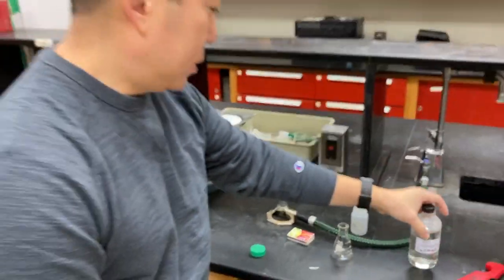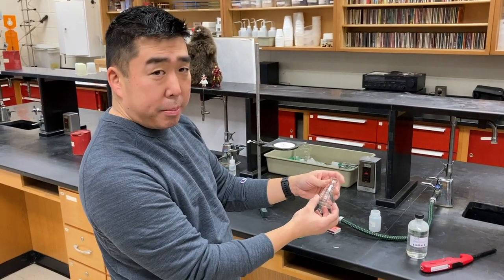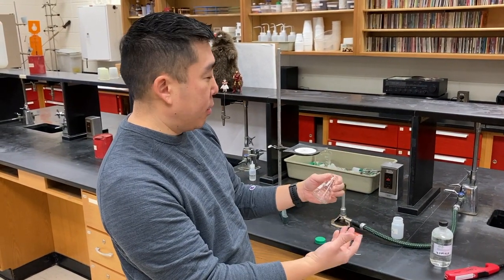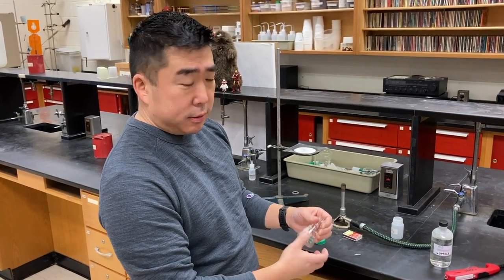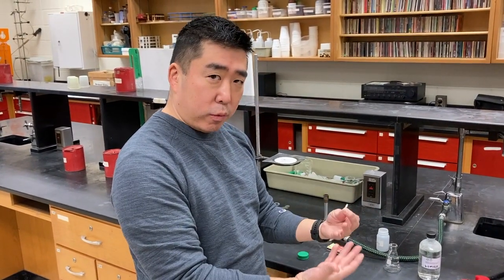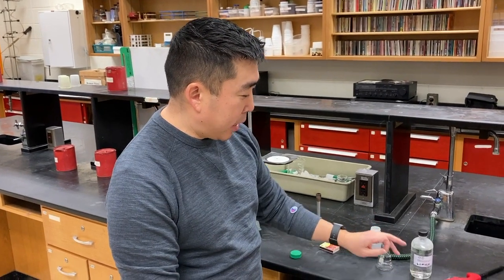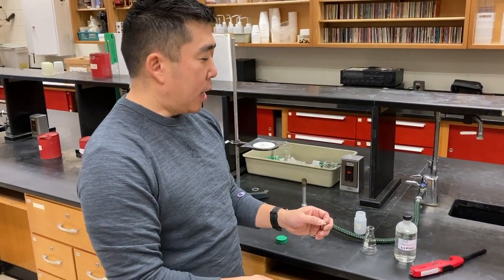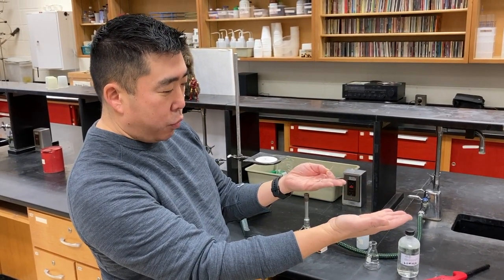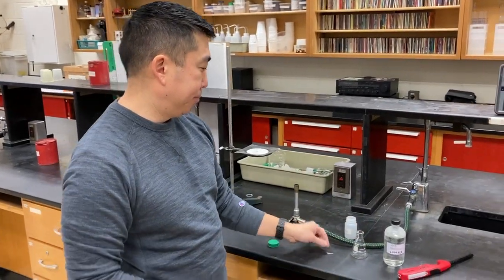So the reaction is going to produce a compound, and we're going to determine the empirical formula of the compound by weight. We're going to weigh the magnesium at the beginning, and then we're going to observe the reaction, and then the product is going to contain magnesium and chlorine. By weighing this at several points during the reaction, we'll be able to subtract, get masses, and determine moles and empirical formula. All right, let's get some data then, shall we?